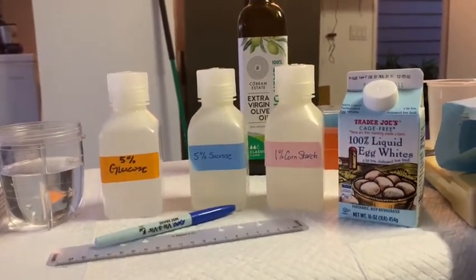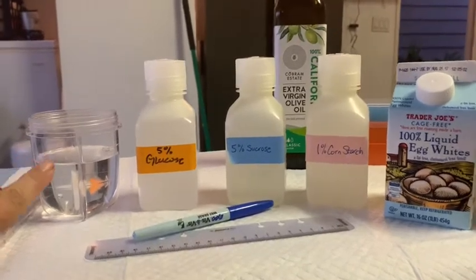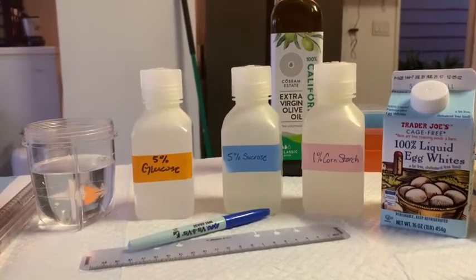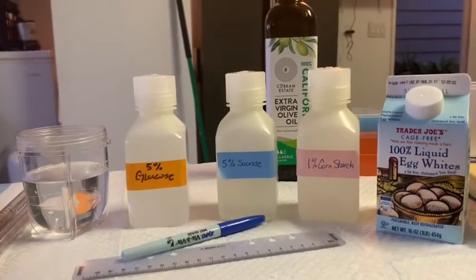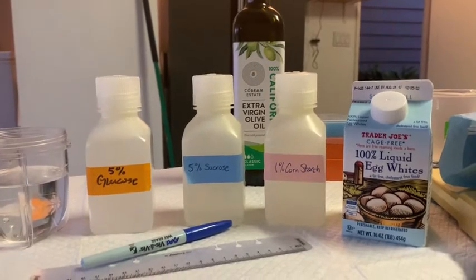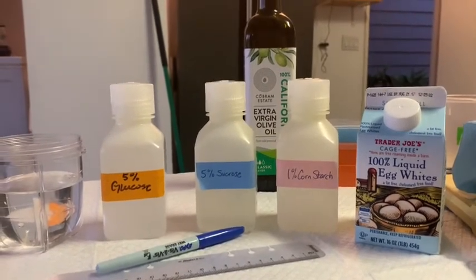For this laboratory, we're going to be utilizing water as a negative control. And for positive controls, we're going to be using things like 5% glucose, 5% sucrose, 1% cornstarch, liquid egg whites, and extra virgin olive oil.